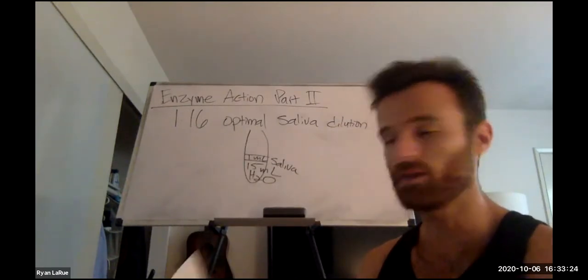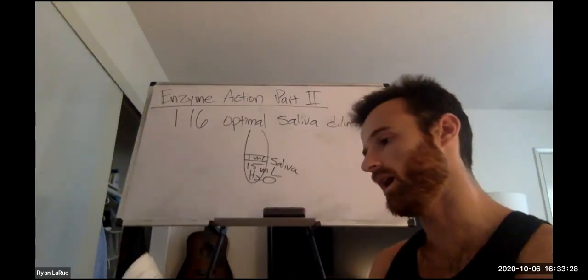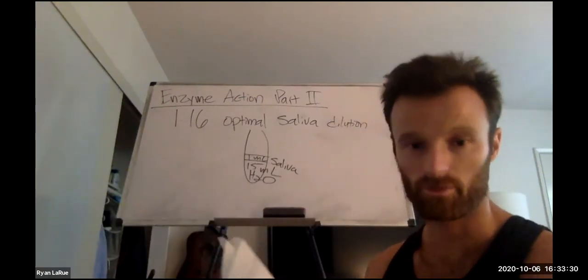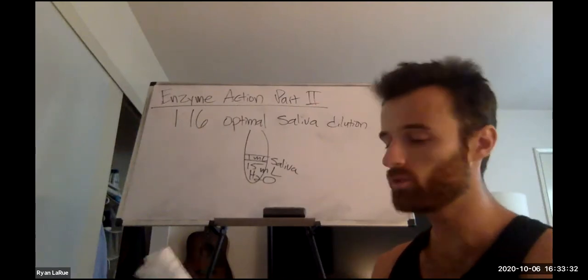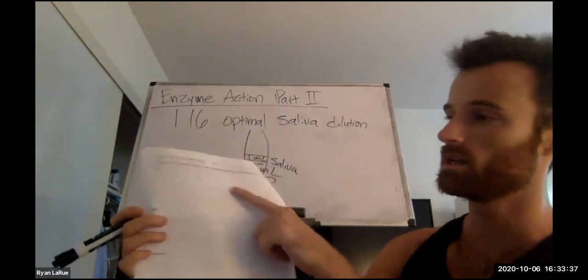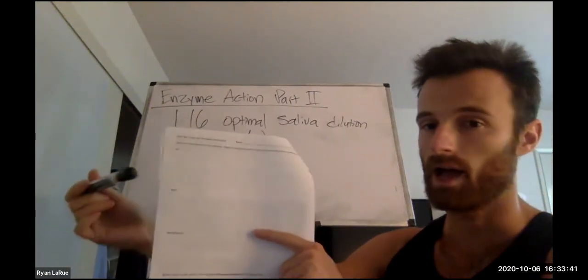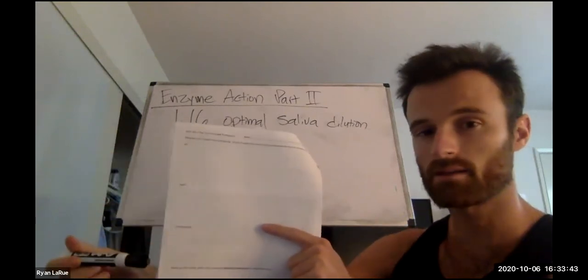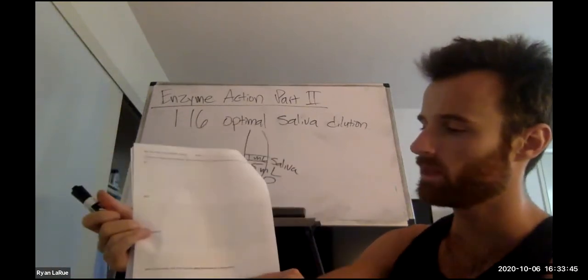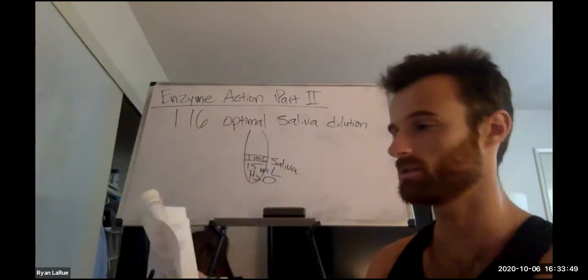It seems like it's true, it's valid. And then you would graph. You only have to do that for one factor. But again, looking at all the data for all the 3 factors, I do want you to answer the questions right before the post-lab questions on all 3 so that you can understand how these factors will affect enzyme activity. And then, of course, the post-lab questions I want you to answer as well.